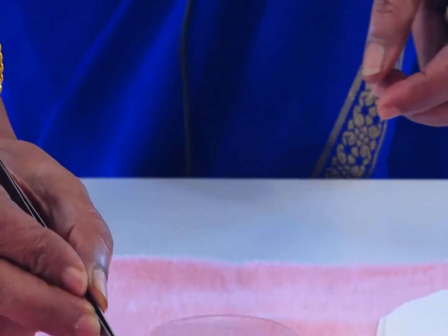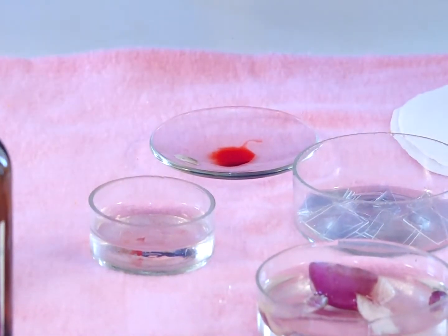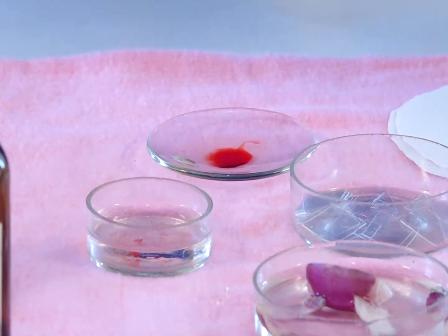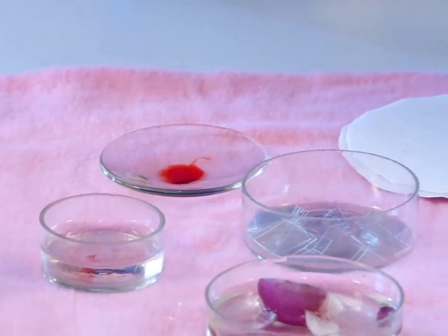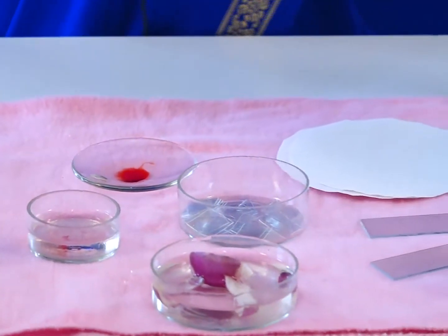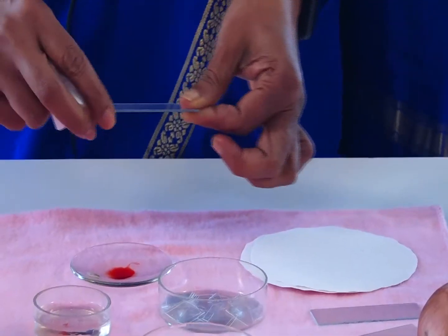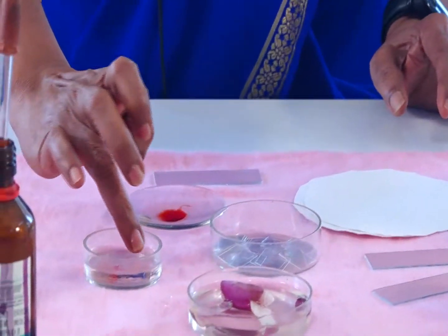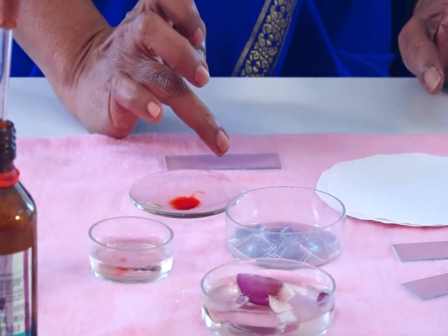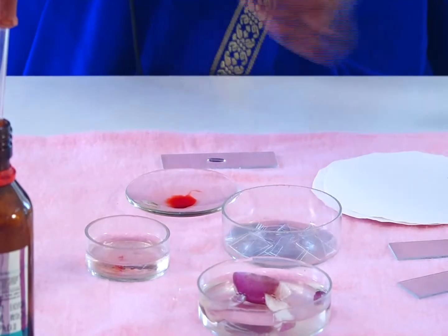The material should be de-stained in water. De-stain it in water. Now begin the mounting. Put the slide and put a drop of water on it.